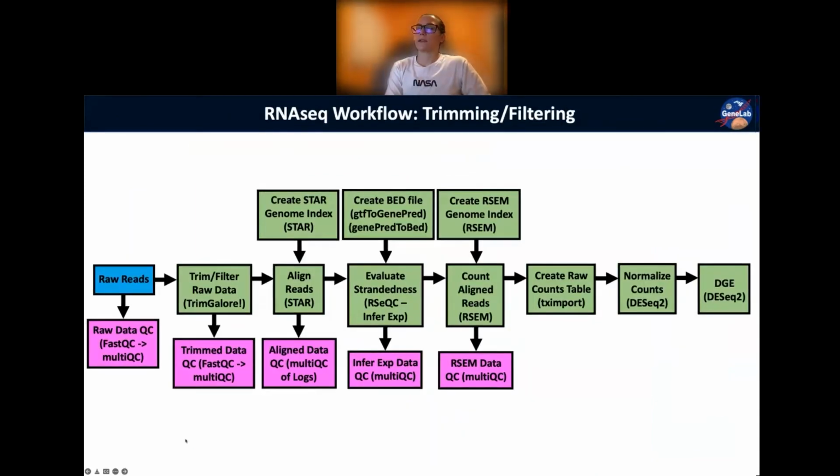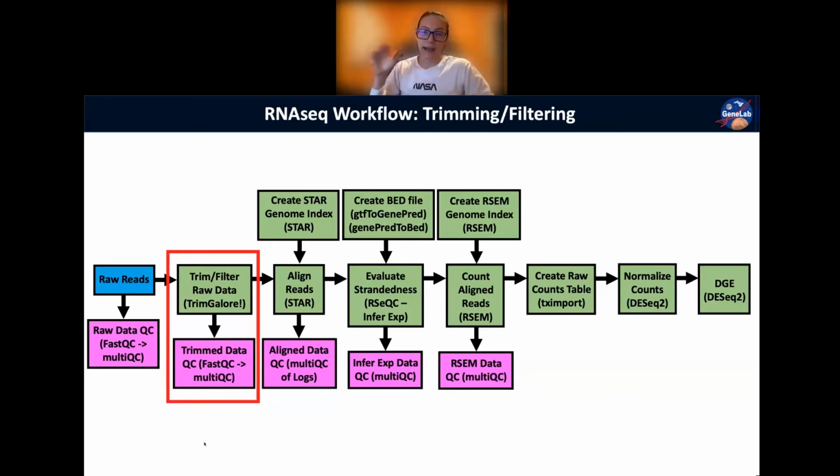Okay. So that brings us to the end of assessing raw read quality. As you noticed, there were some adapters that we identified in our reads. There were also some outliers with low quality base pairs towards the end. After looking at the quality of the raw reads, we can be confident that we probably want to trim and filter this a little bit to clean it up before we align it back to our reference genome.